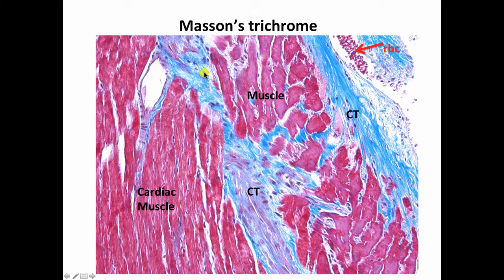Masson's trichrome or Mallory's trichrome stain will stain connective tissue rich blue, or sometimes green, but generally blue, and will stain muscle red. In this slide I've brought up cardiac muscle, but the same would be true with skeletal muscle or smooth muscle. Where you have a mixture of connective tissue overlying muscle, it will stain a sort of purplish color. Additionally, it will stain erythrocytes — red blood corpuscles, seen in this vessel here — a reddish color.